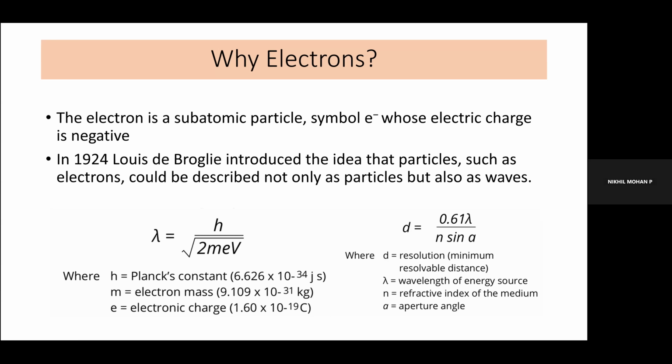We cannot produce an electron beam in normal room conditions, because we can just switch on a bulb in this room and we will get photons, light, everywhere in the room. But if we switch on an electron gun in this room, we cannot generate an electron beam there. That is because an electron generated from the gun, the next moment it will be absorbed or scattered by the particles. There are dust particles or maybe air molecules all over. So we cannot produce an electron beam in this kind of room condition. So we should have a very high vacuum condition.